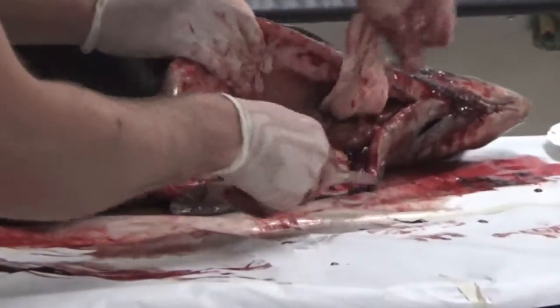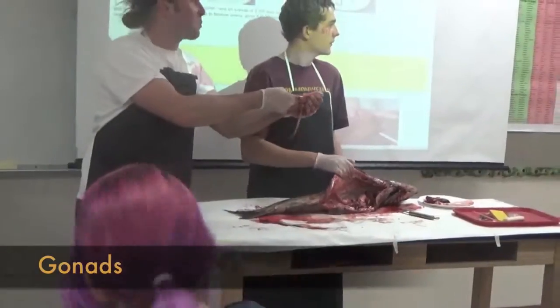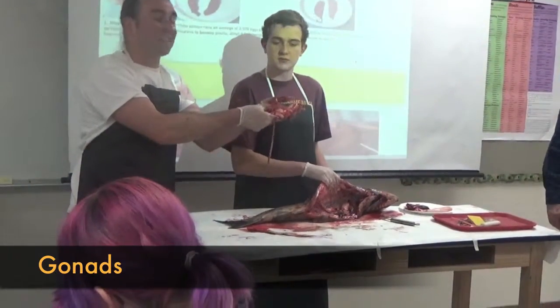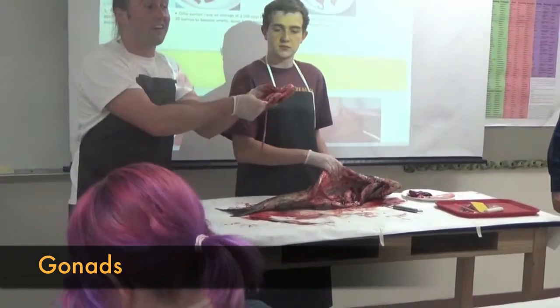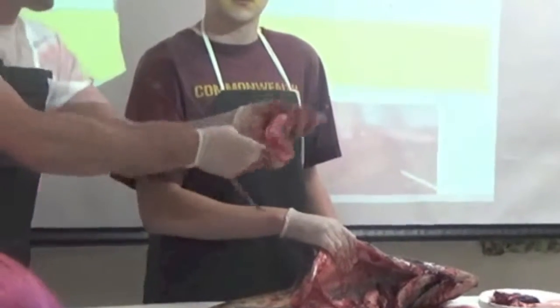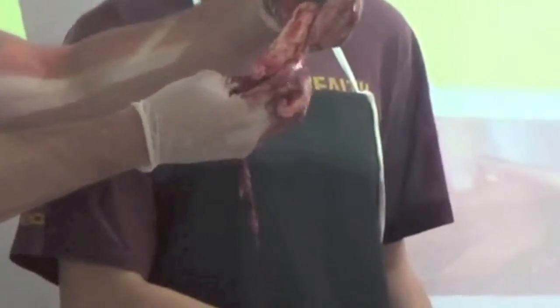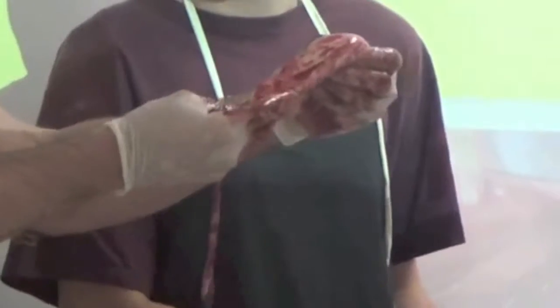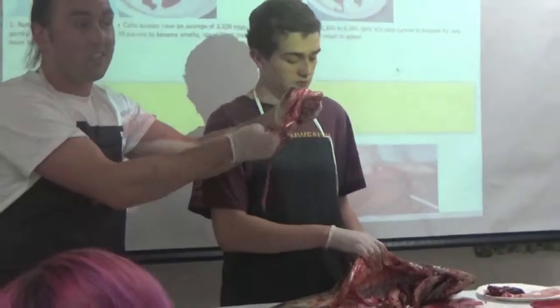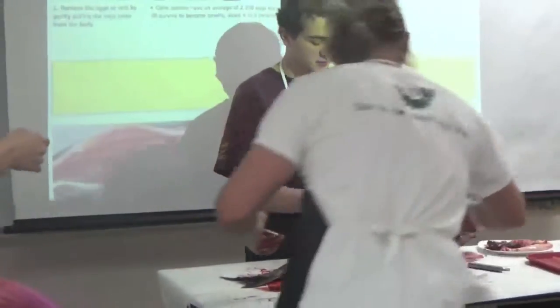You want to cut those gonads out. This size gives you an appreciation for how much sperm and egg these fish carry, and how much of their life is dependent on reproducing. This is just one of the two male gonads, and it's deflated — it doesn't have anything left in it. But when that was full, it probably took up over 50% of the fish's internal anatomy. That's a pretty wild piece.